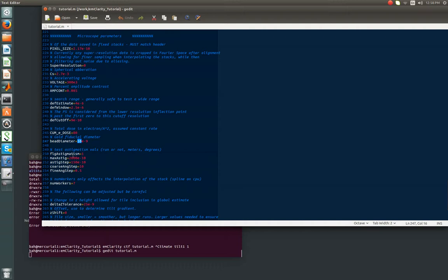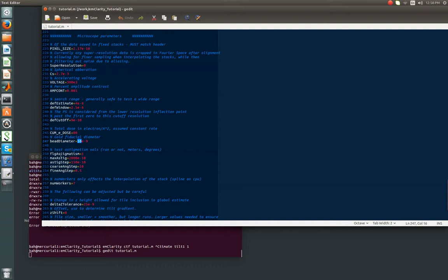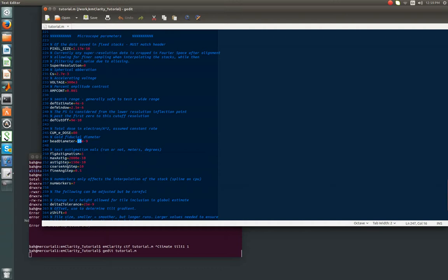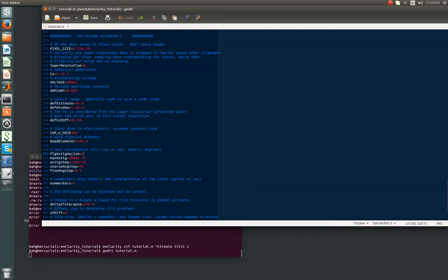We use the optimal exposure filter that Tim Grant and Nico published. So the bead diameter refers to the diameter of the fiducial markers, which in our case was 10 nanometers, and then there's some astigmatism parameters, which we'll call those advanced parameters from now. This is a wide enough range that you probably shouldn't have to change it. If for some reason you want to turn it off, you can change that boolean to a zero. Otherwise, this is pretty robust as well, and for this particular data set, I can't remember the number off the top of my head, but it's pretty small, about 100 angstroms.